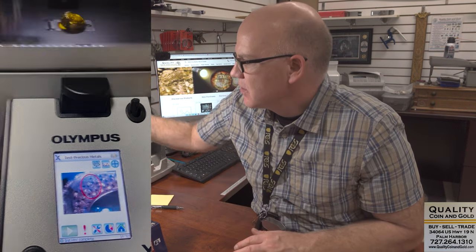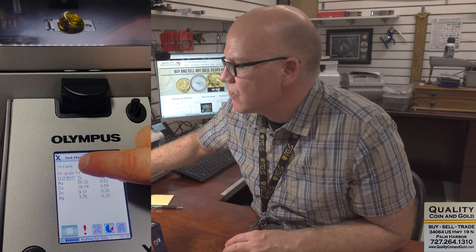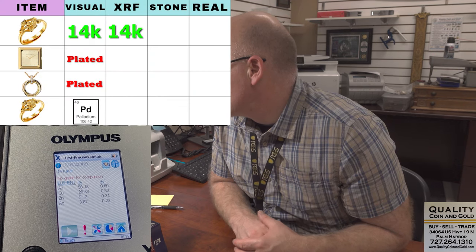Just going to hit go. XRF uses X-rays — correct — so it's taking an X-ray on the surface of the item right now. It's going to do 10 different tests. Initially it's coming back as 14K — with the breakdown of 58.18% gold, 28% copper.